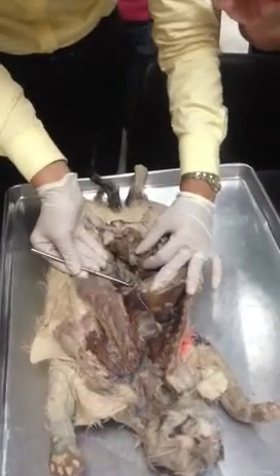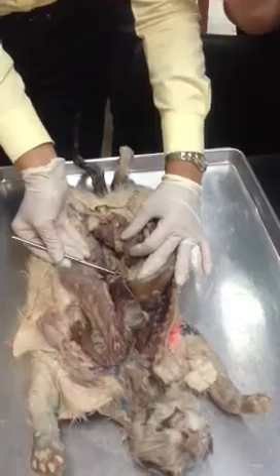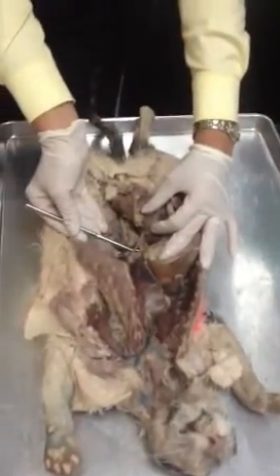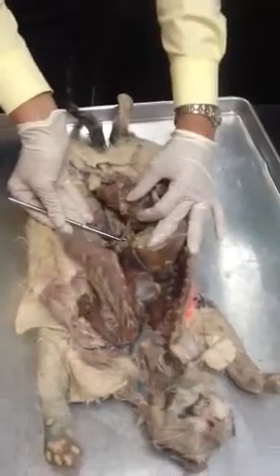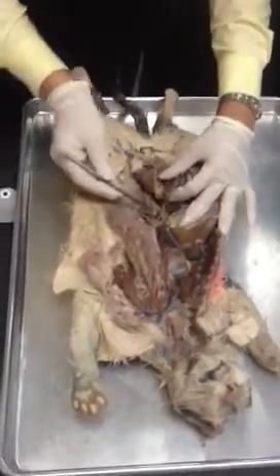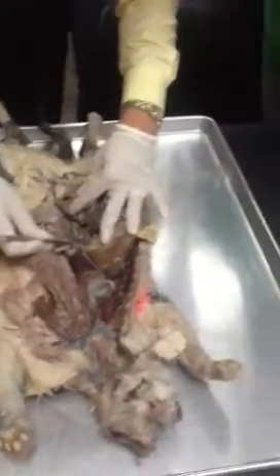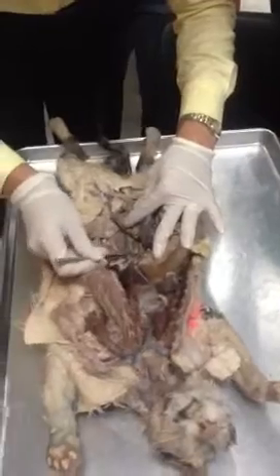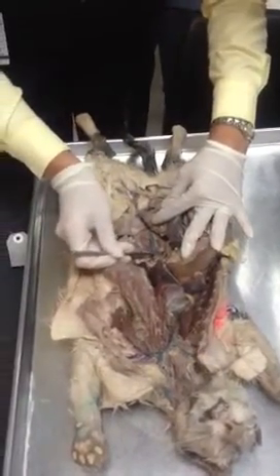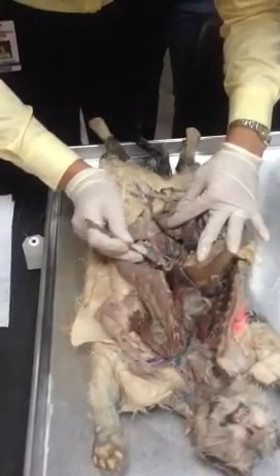Then another one, this one is the superior mesenteric artery. Superior mesenteric artery supplies the small intestine plus ascending and transverse colon. Right? That way, this is the superior mesenteric. And here we have a kidney, right? And then to the kidney, this is the renal artery, and this one would be suprarenal, or at least should be. Oh, no.